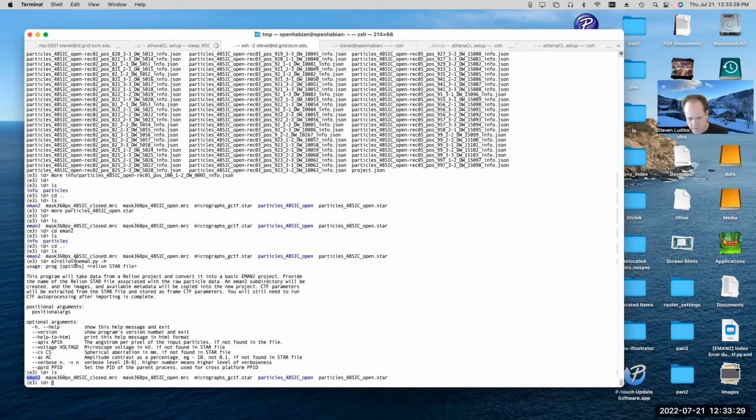The trick about this program is it preserved information about the micrographs. It preserved the angstrom per pixel and the voltage and the Cs and stuff like that, but it intentionally discarded all of the orientation information that was present in the star file. So the idea would be if you wanted to re-refine your data set in EMAN2 for comparative purposes, you could run this program, make an EMAN2 project, and run an EMAN2 style refinement in that same project, starting from scratch with all the orientation parameters, and make sure you get the same result.